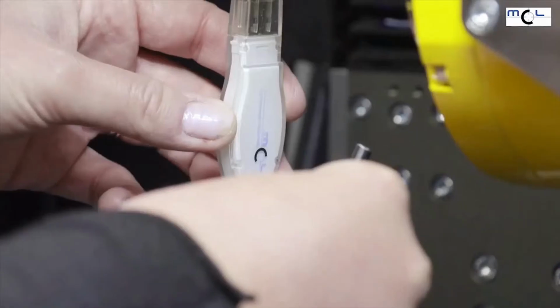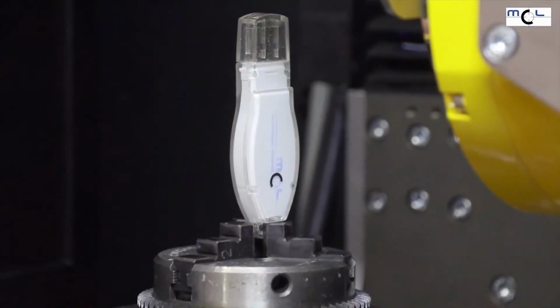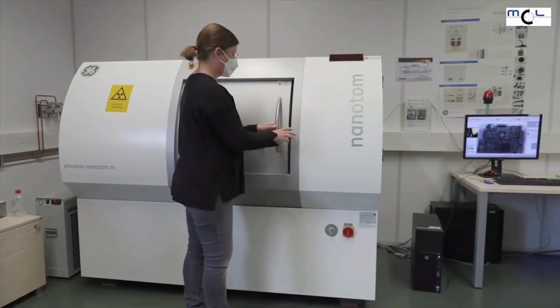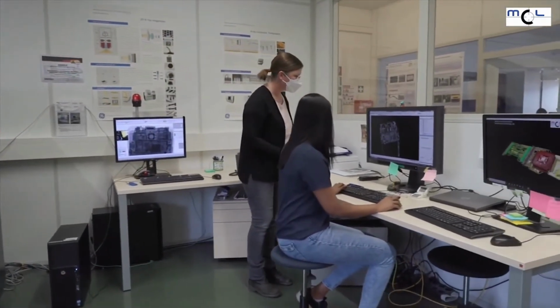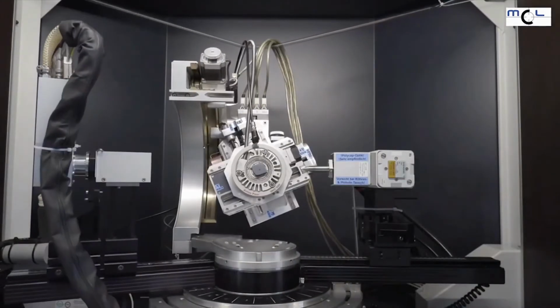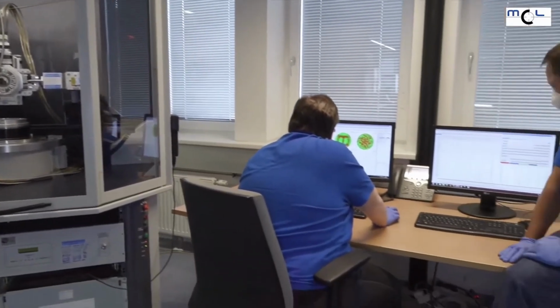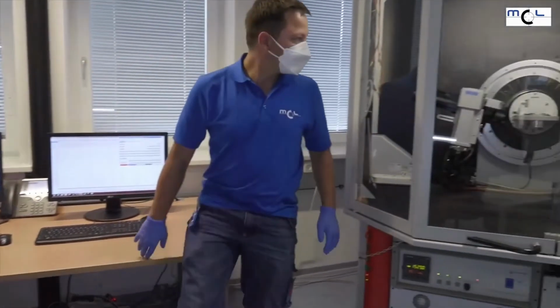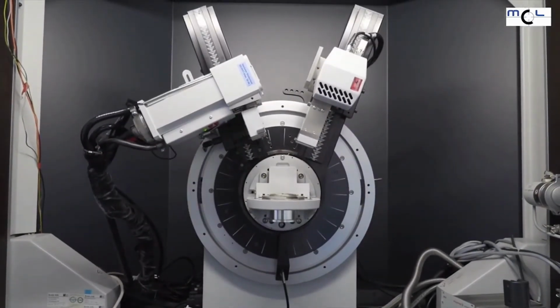Complementary to the 3D scanning electron microscopy, we operate the computed tomography. As a cross-scale method, samples from large components up to sub-millimeter can be examined for materials research. In the field of X-ray structural analysis, we determine different crystallographic parameters which are important for component analysis, but also for the validation of our computer models. This gives us the opportunity to design and validate properties at the crystal level.